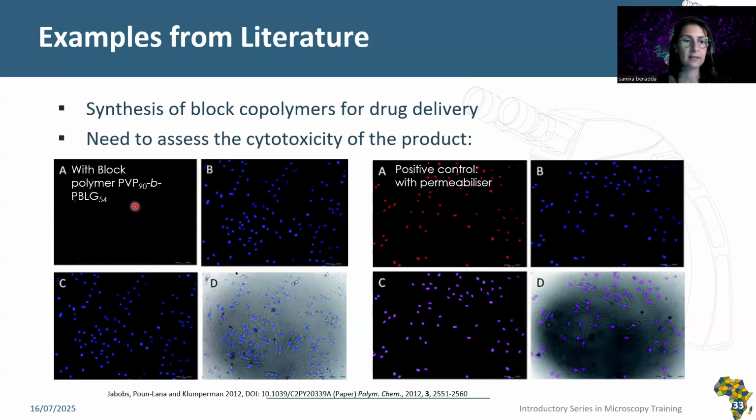So that indicates that the cell membranes were still intact. So it's very important because now we can see that this polymer is not toxic to our cells.